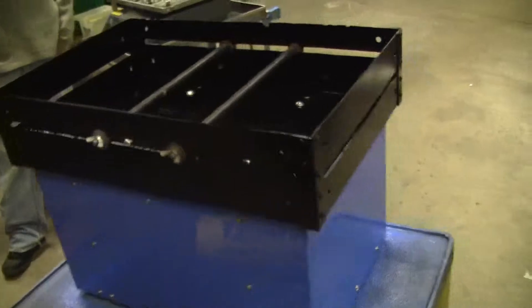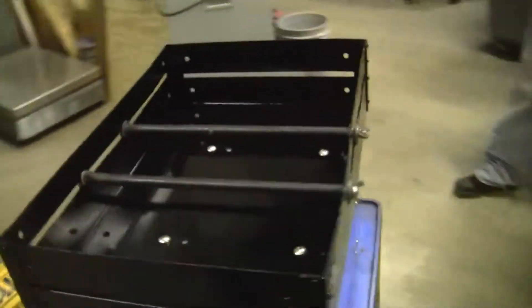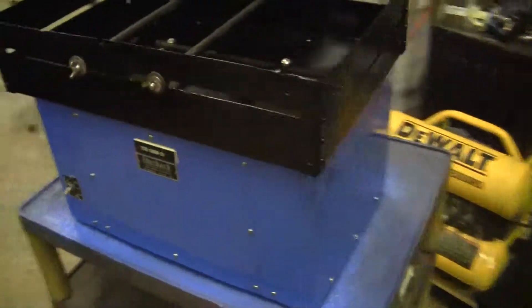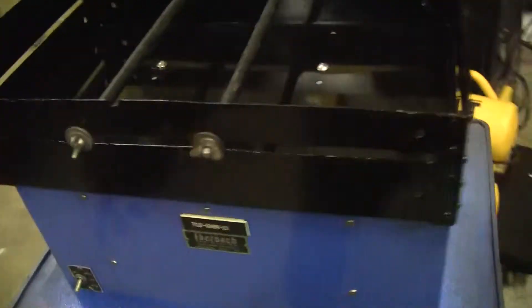The rear of the unit. If you have any further questions, please don't hesitate to call 609-518-9100. Thank you from Hi-Tech Trader.